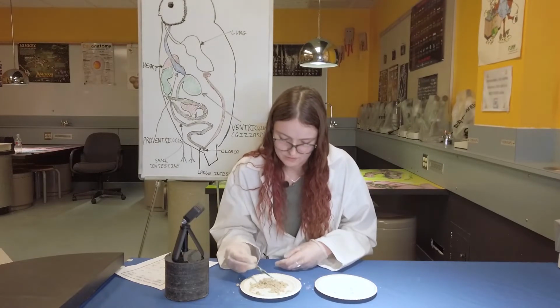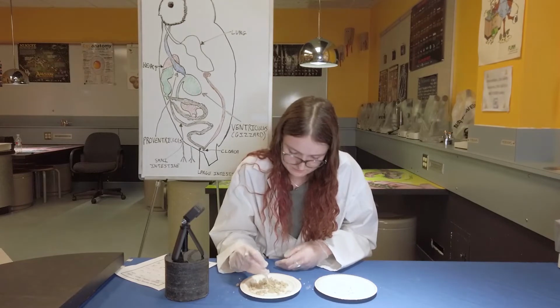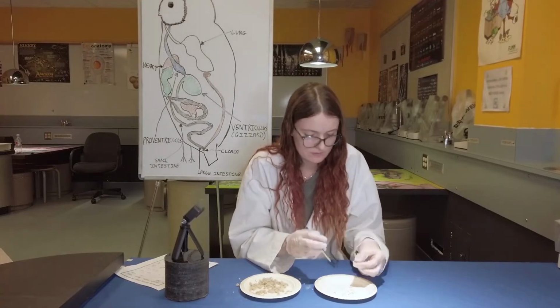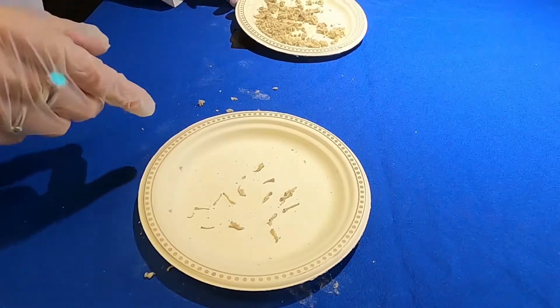Okay, so it looks like I've found all the bones I think that we're going to find. Now we're going to do the fun part, which is actually trying to figure out what they are. So we're going to bring this plate closer, put that one over there.